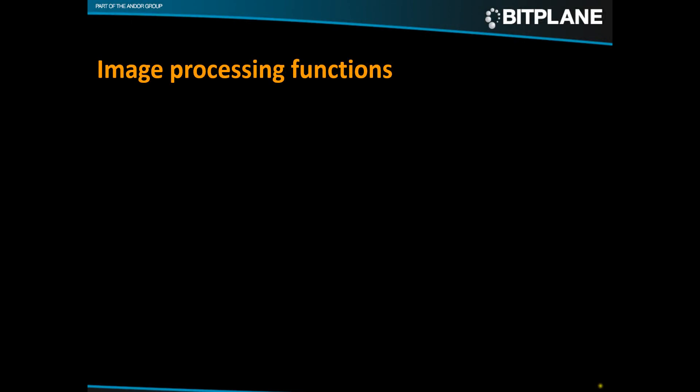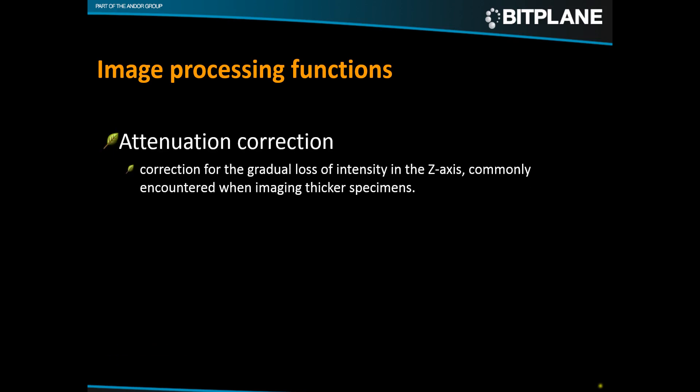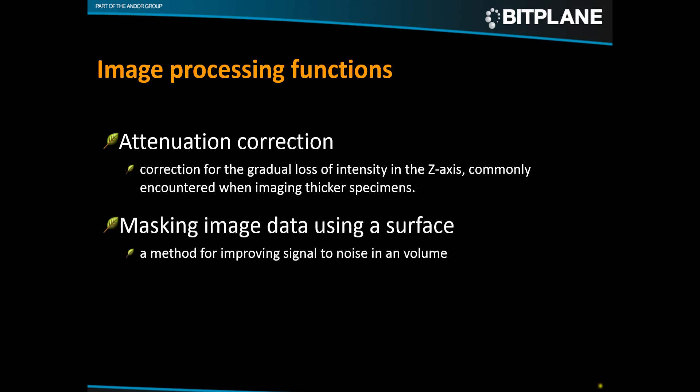I'm going to be focusing on two image processing functions in particular. The first is an attenuation correction, which allows you to correct for the gradual loss of signal or intensity in the z-axis. The second is a masking function using a surface, which allows you to improve your signal-to-noise in a volume, making the visualization and analysis of that data easier.